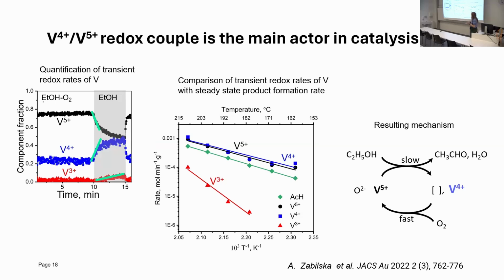And looking at titania, we could confirm that titania was really redox inactive in this catalysis. So it was promoting vanadium, but it was not redox active itself, which in principle we expected, but now we could quantitatively see that it is really the fact.